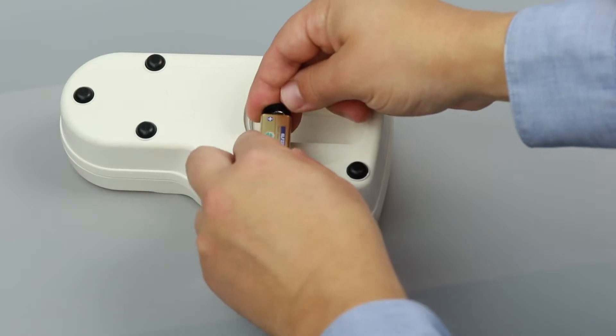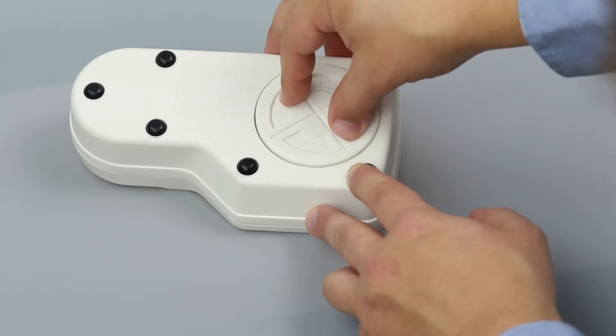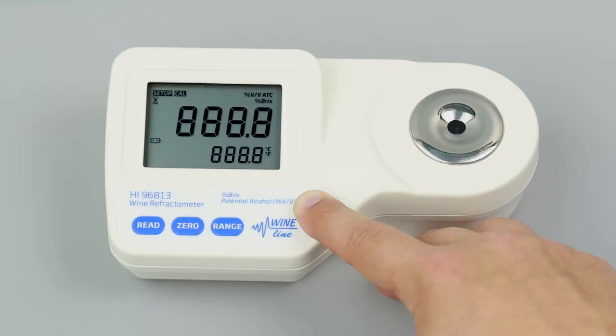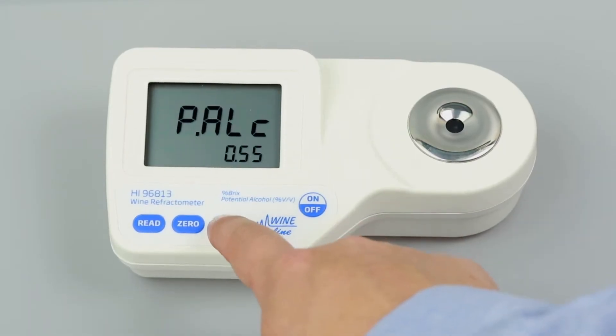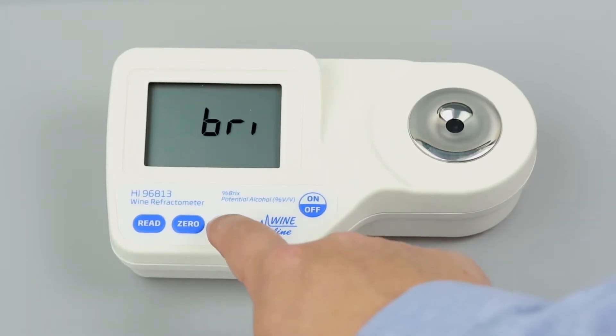To set up your meter, install the 9-volt battery in the compartment. To select your temperature units, press and hold the ON-OFF button until the screen flashes. Continue holding ON-OFF and press 0 to change from Celsius to Fahrenheit. To change the measurement units, press the range button until your desired unit appears in the top right corner. This meter measures in potential alcohol and percent brix.